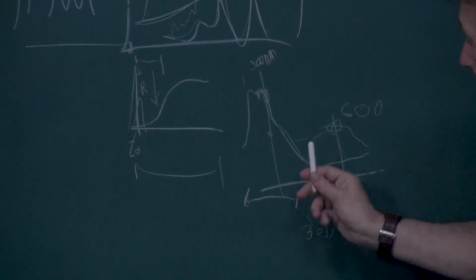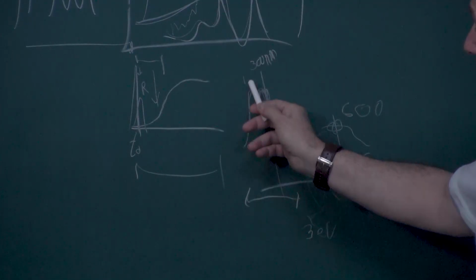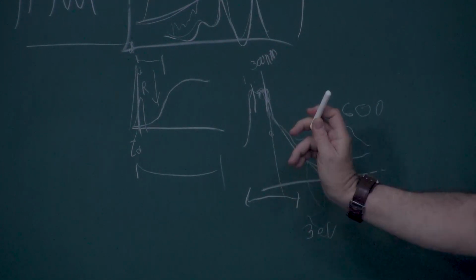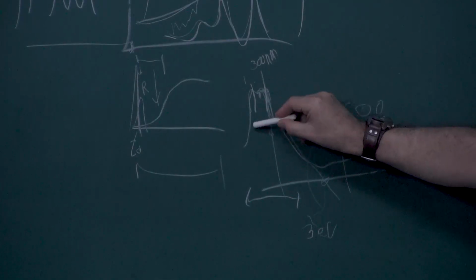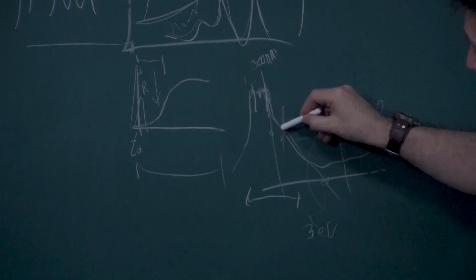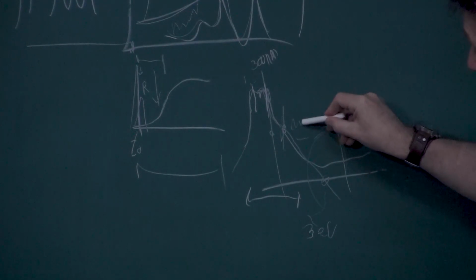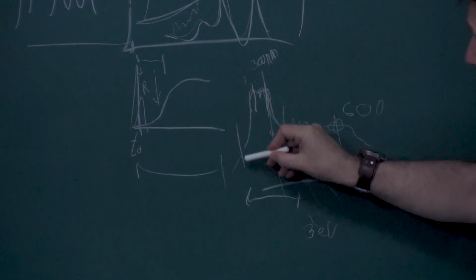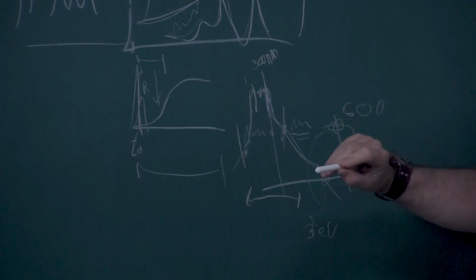The problem for the resonance is that you are using a laser here or here, and the spectrum may look very different with this laser than with that laser, because in this case you are going into the resonance effect. Or sometimes something happens near resonance. If you do it over here, you get some resonance, not absolutely, but you enhance a little bit, and then the photons come out at this wavelength, and they come out nicely. But if you use a laser here, you don't get a big resonance, but then the Raman photons will come like this, and they will be absorbed by the sample.